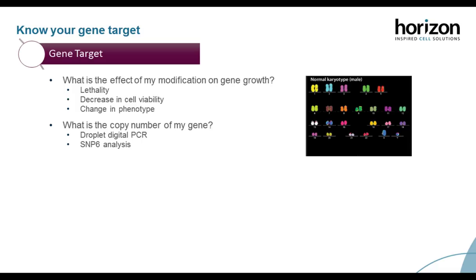However, this is a very rare genotype for your isolated cells in culture. If you pay attention to chromosome 1 in this next insert, in this HeLa cell line, you actually don't have 2 alleles for chromosome 1, but you actually have 3. And you have a whole host of other genes that aren't reminiscent of any other chromosome down the bottom of the screen. This is more of what we have in our general cell culture in any of these cell line adapted cultures that we grow as our model systems.